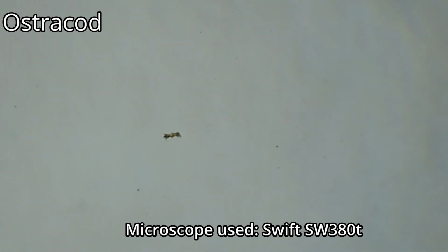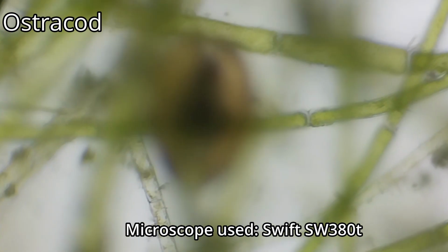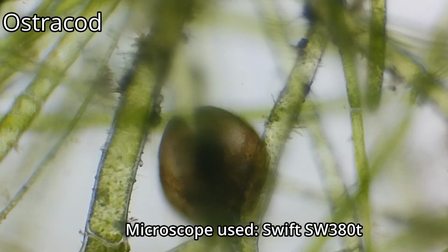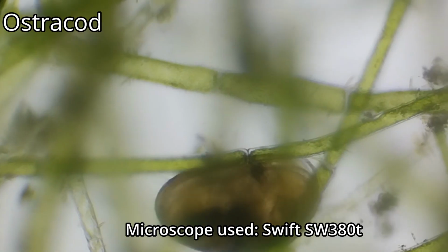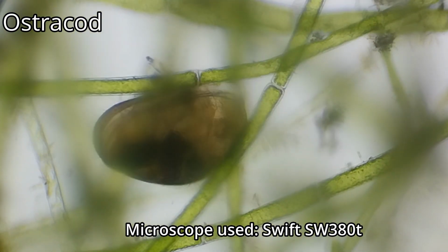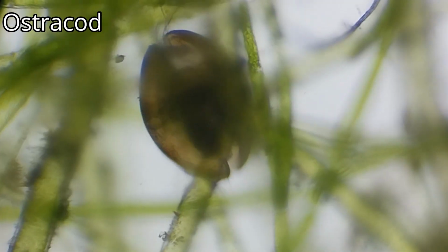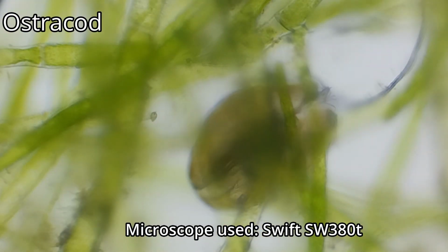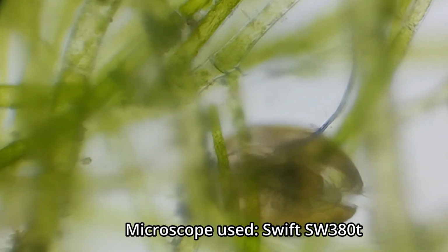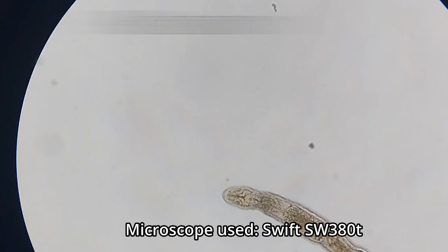A lot of ostracods are benthic, meaning they can be found crawling on the sediments in the bottom of the pond. Other ostracods can be found crawling on macroalgae. And while ostracods seem to be common in this freshwater body, I was never able to observe them under the Swift 380T microscope before. While I was able to observe freshwater ostracods using a digital microscope, and marine ostracods using this microscope, but never freshwater ostracods using this microscope, until now.